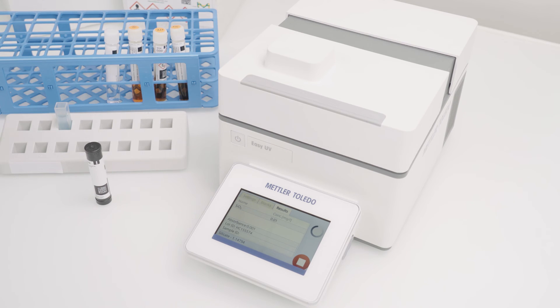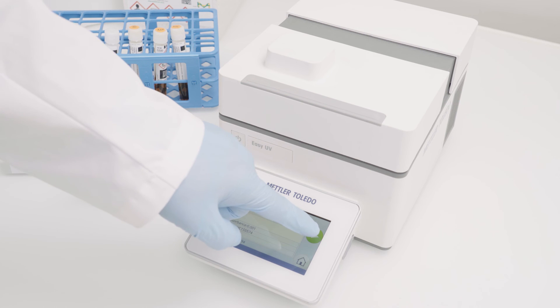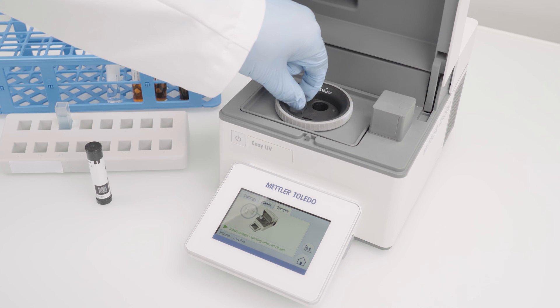If a result is out of limit, LO or HI together with an arrow is shown. To perform the next analysis, click the Start button and follow the instructions on the screen.